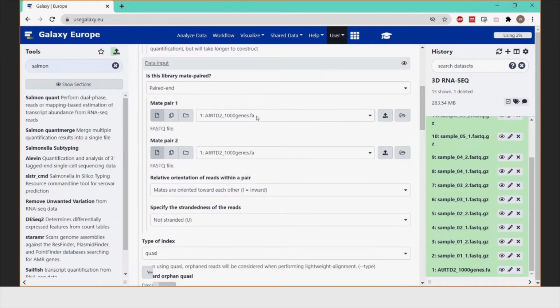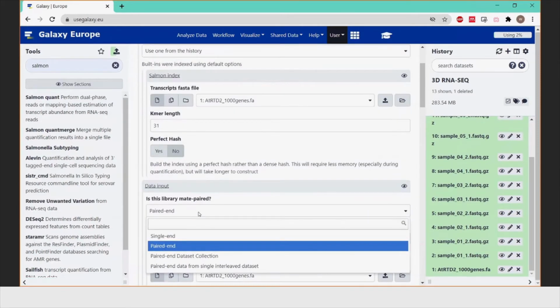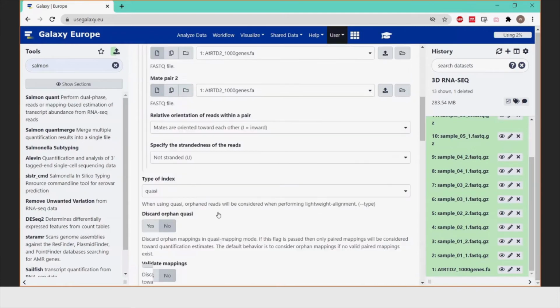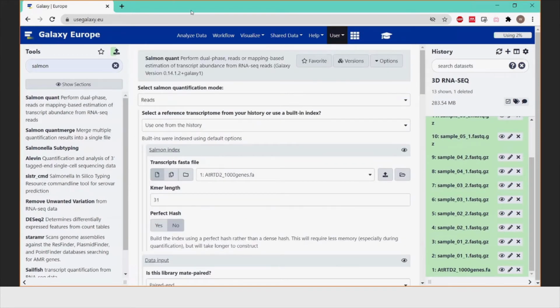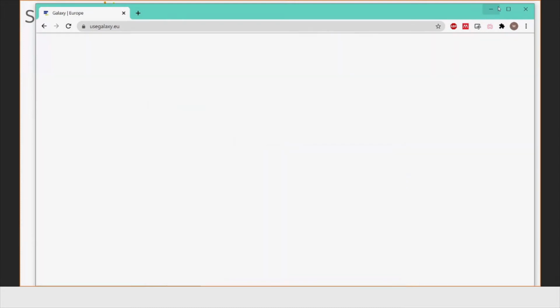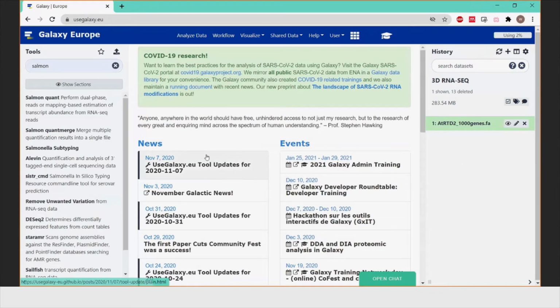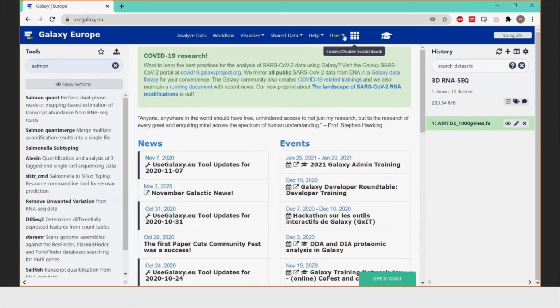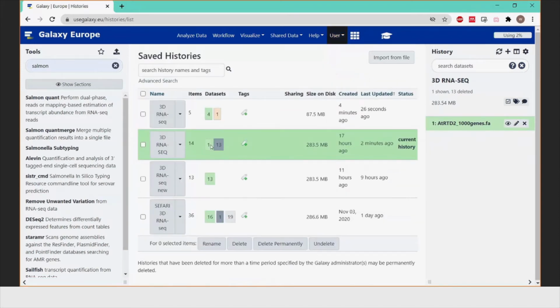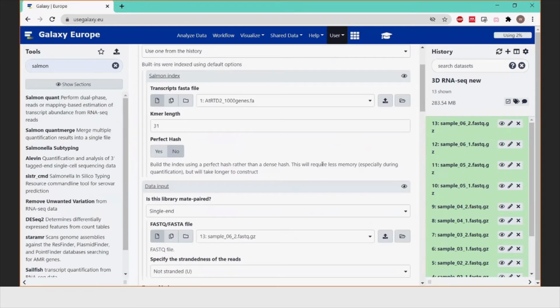Then it's a bit weird. So this seems something wrong here. Okay, the data has been deleted. So I'm going to use another set. Yeah, I always prepare backups, so don't worry about it.